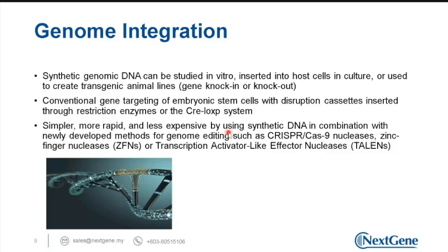So if you are doing related study or you are interested to perform gene editing, gene synthesis techniques or method could be useful to speed up the whole process.